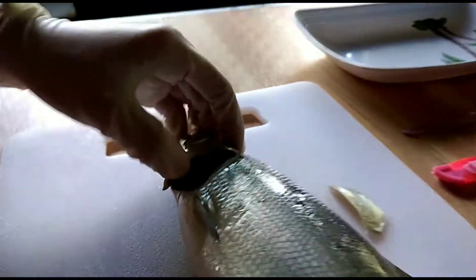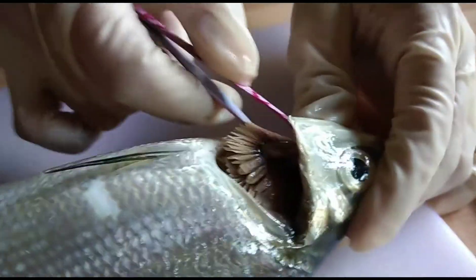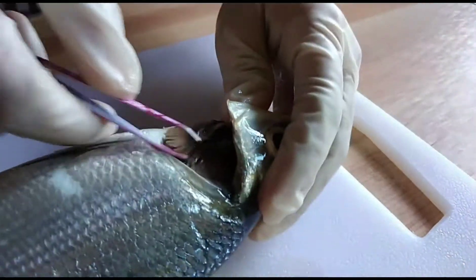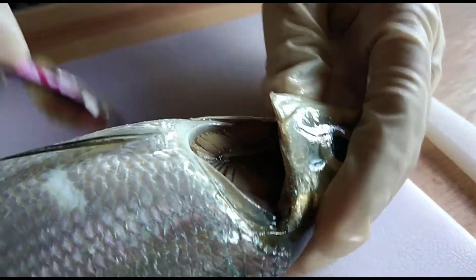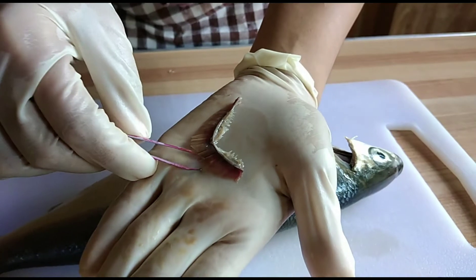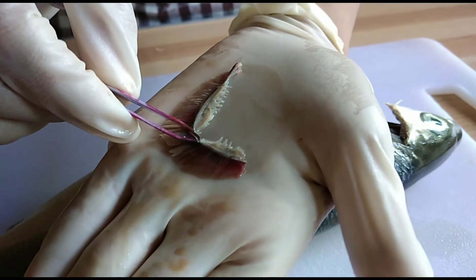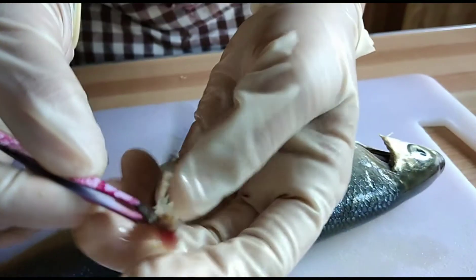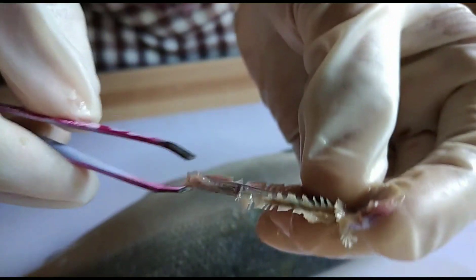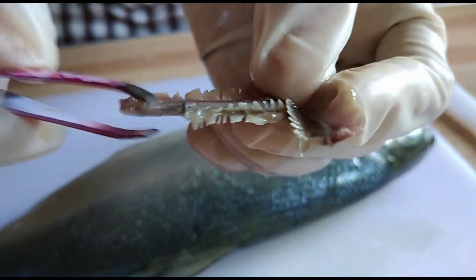You can now see the gills. This one is the gill filaments, the gill arches, and the gill rakers. The gill rakers, the filaments, and the arches.